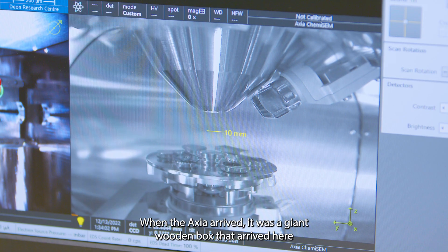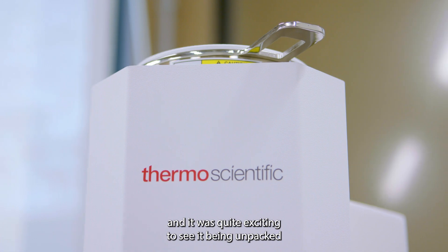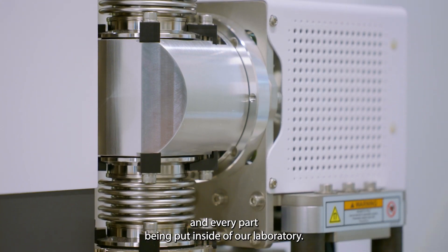When the Axia arrived, it was a giant wooden box that arrived here, and it was quite exciting to see it being unpacked and every part being put inside our laboratory. I felt like a kid again.